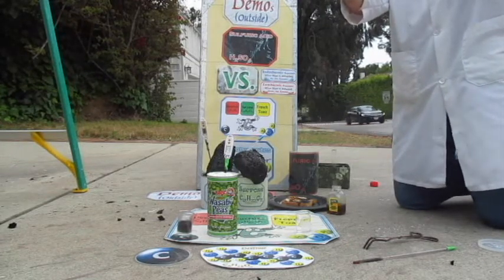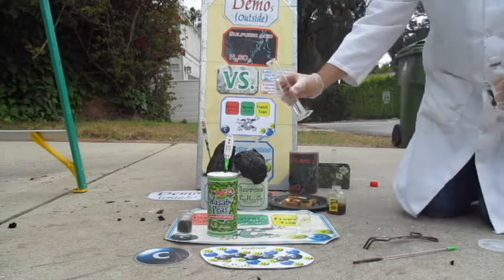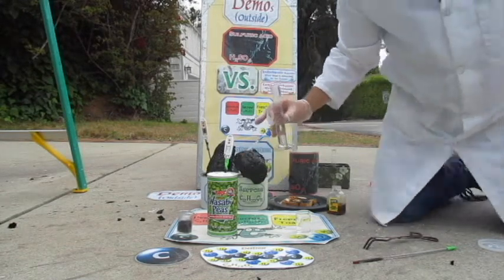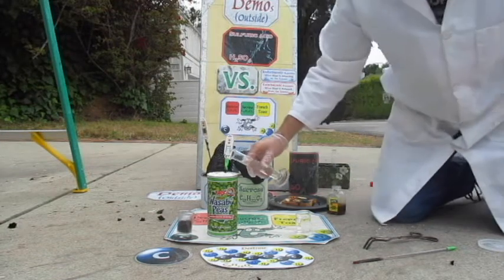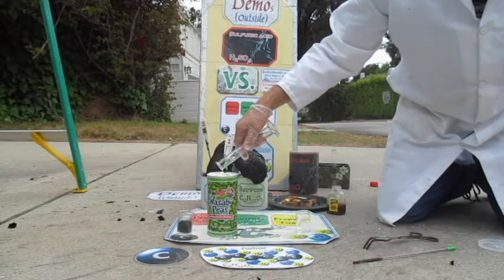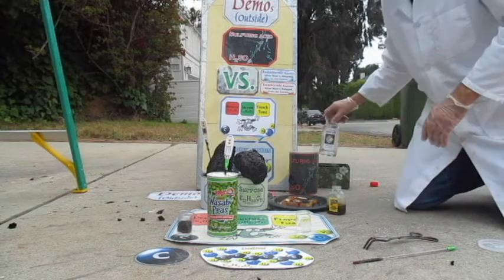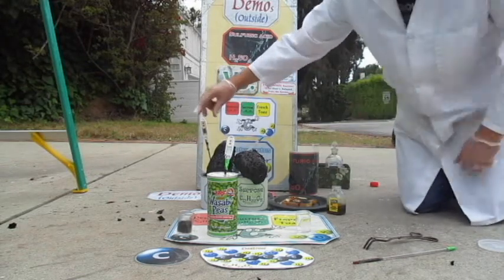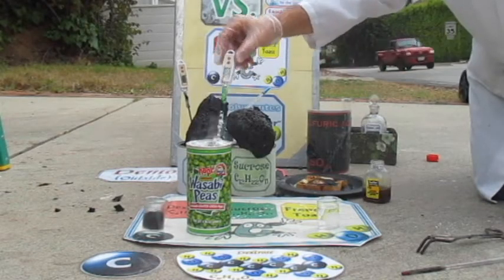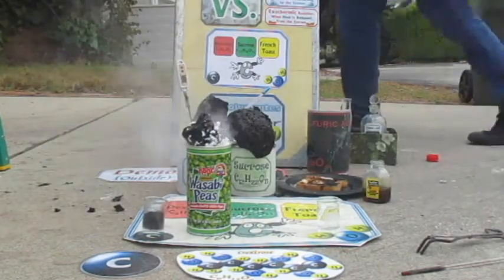This one. Okay, there's another 50 milliliters of H2SO4 going into there, and it says right now 27.6 degrees. Let's see what it goes up to after the reaction. Remember, you can tell if it's an endothermic or an exothermic reaction by what happens on your thermometer. This one's still in the 140s. Actually, I'll stick it in afterwards. This one's still in the 140s. I gotta get out of the path of these fumes.